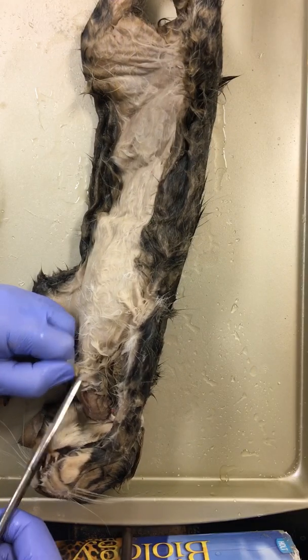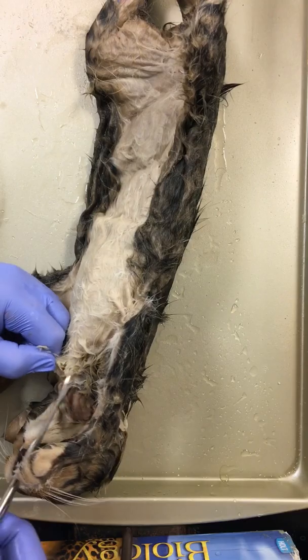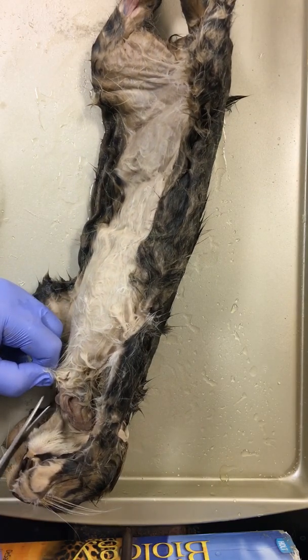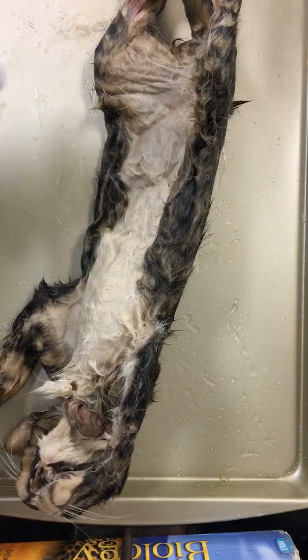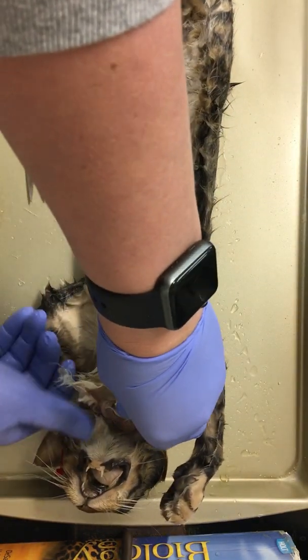The skin on most of these is extremely tough, and that's because cats get into fights — it's very durable. Our integumentary system is made up of three main layers: we have our dermis, our epidermis, and our subcutaneous layer. You'll notice it's held to our muscle by connective tissue.